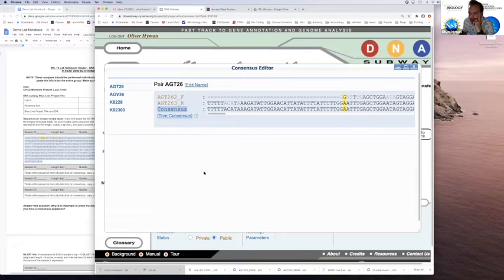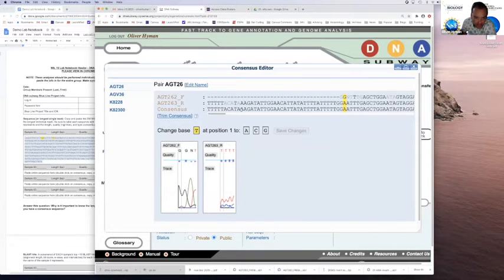Essentially what the software is doing is saying, I've got a forward read this direction and a reverse read this direction. Let's combine those two together and see where they align. And then let's make an individual single barcode out of that based just on the forward sequence. So we're going to flip the reverse sequences over to their complementary base pair to make a single sequence called the consensus sequence. I'm just going to show you. Remember, the consensus sequence is this bottom one.